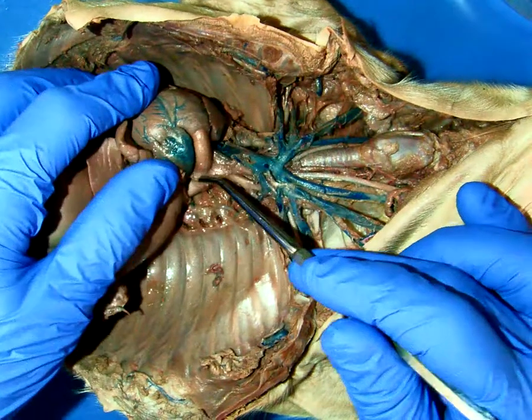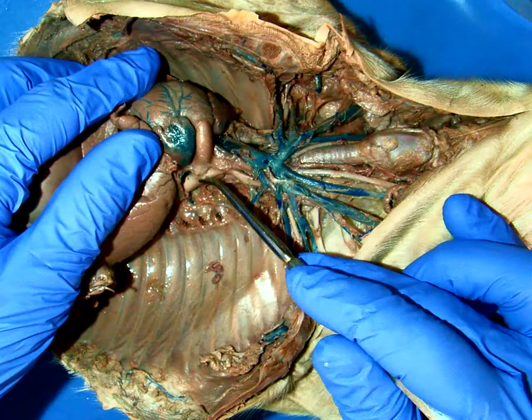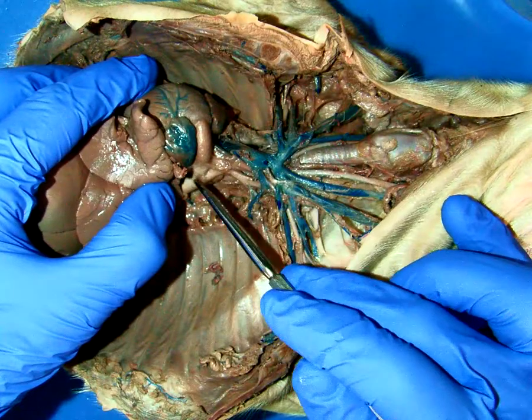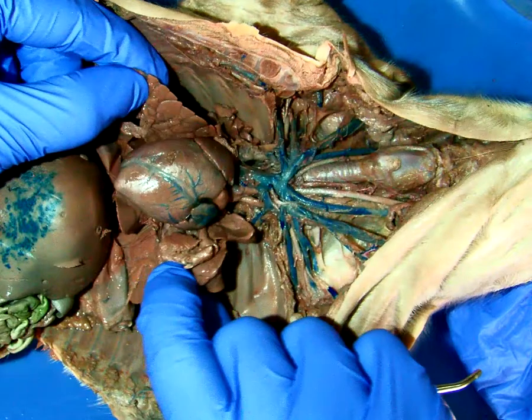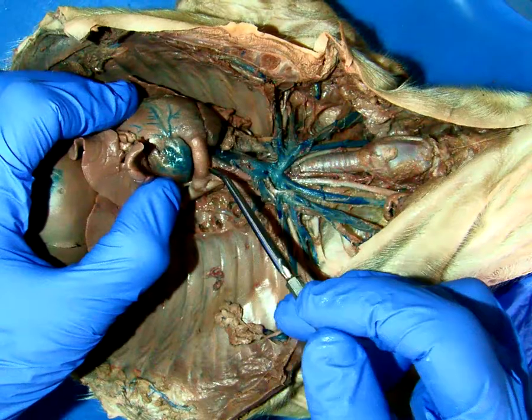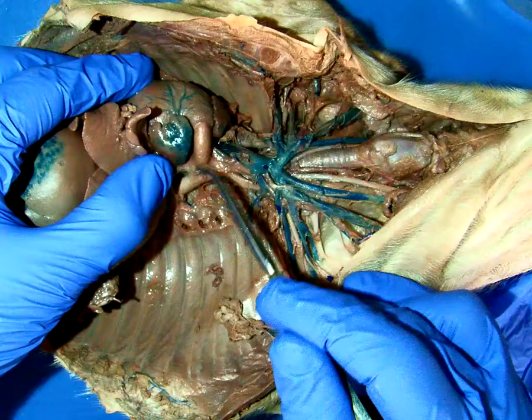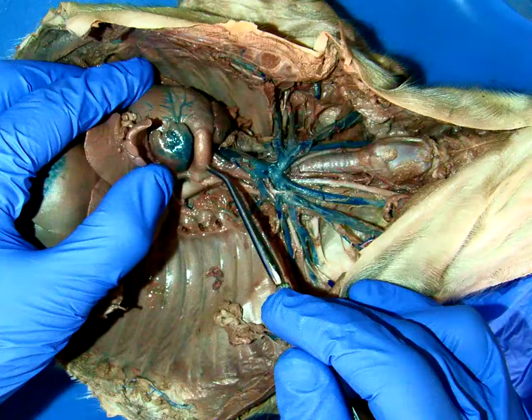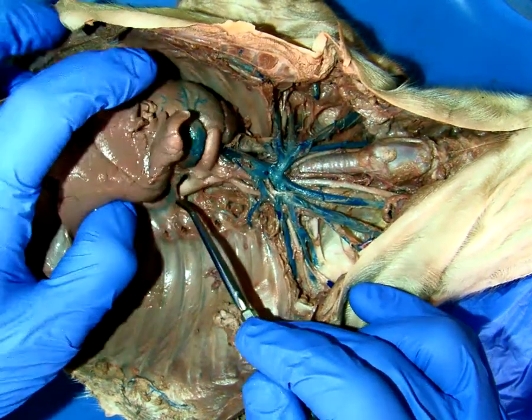Okay, the pulmonary artery actually joins the aorta in the fetal circulation. So here's the joining of this right here, called the ductus arteriosus. Otherwise, the pulmonary artery does continue to deliver blood to the lungs, and these, if you didn't realize, are the lungs in the pig surrounding the heart. But some of the blood from the right side of the heart is actually diverted into the systemic circulation by this little tube. This will go away and become the ligamentum arteriosum after this pig is born and begins to mature. And it's the same for you guys as well.